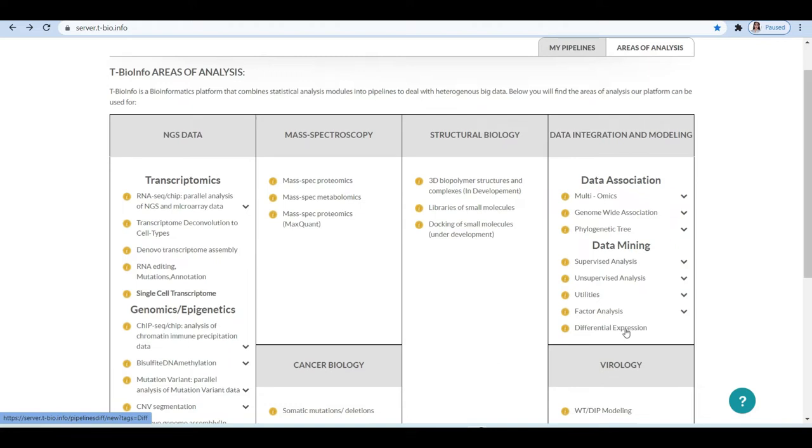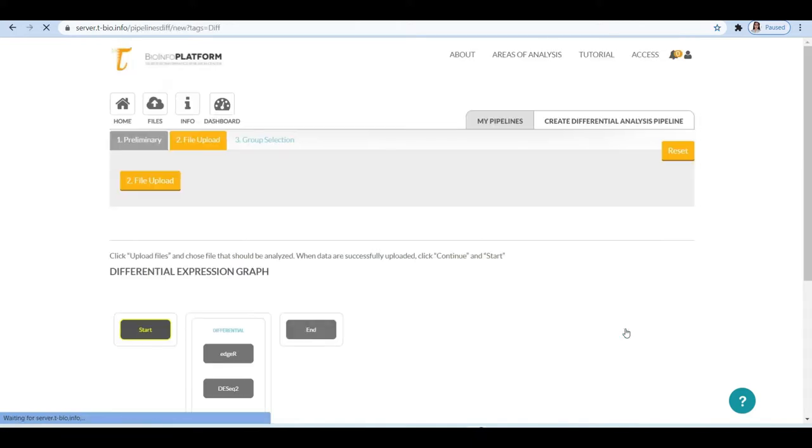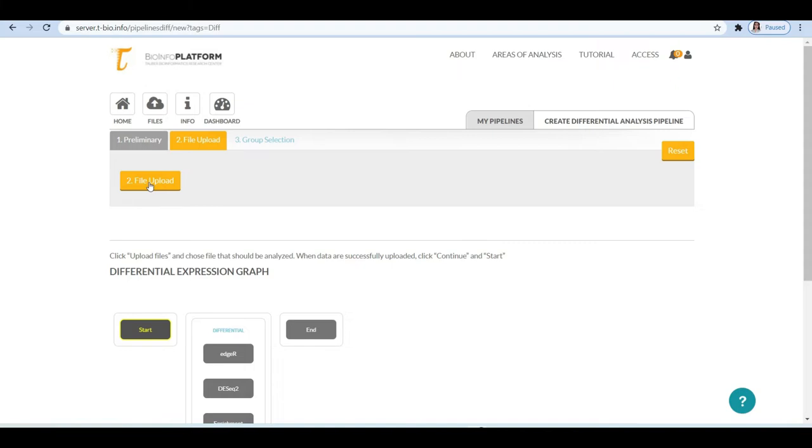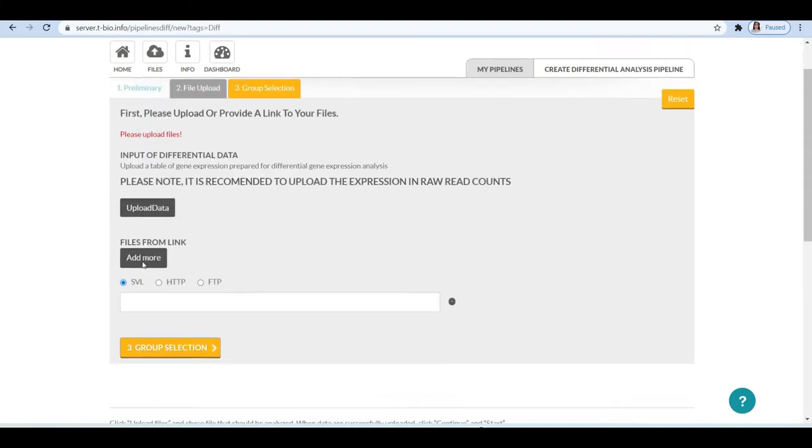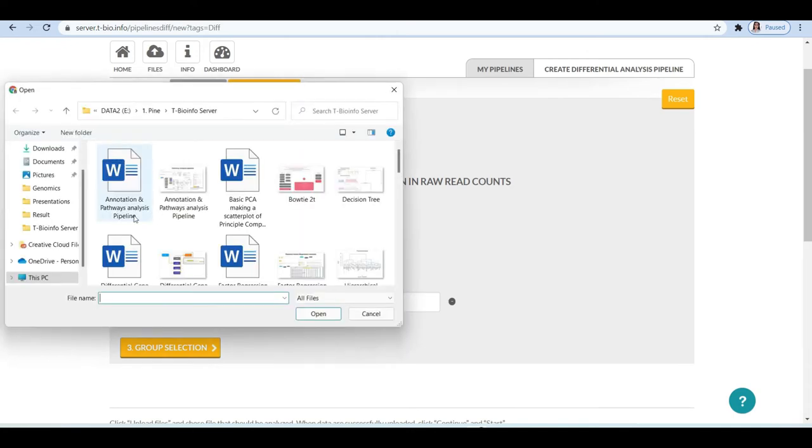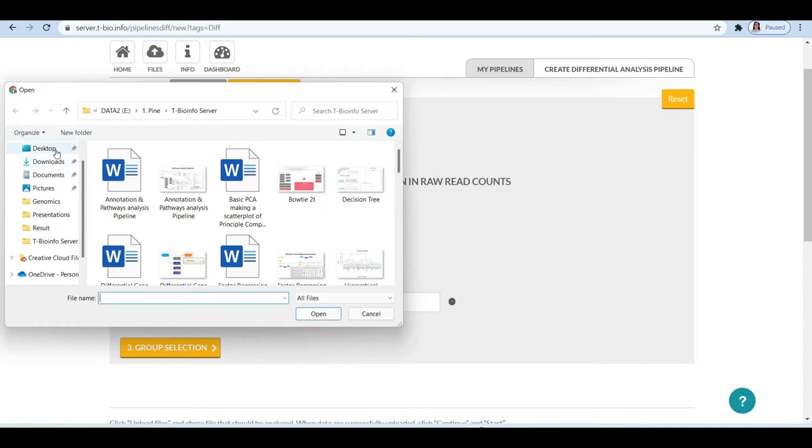The first step is to perform the differential expression analysis. For that, we need to select the differential expression option under the data mining section on the t-bioinfo server. After clicking on the differential expression option, you will be directed to the file upload interface, where you need to click on the data upload button to upload your file.